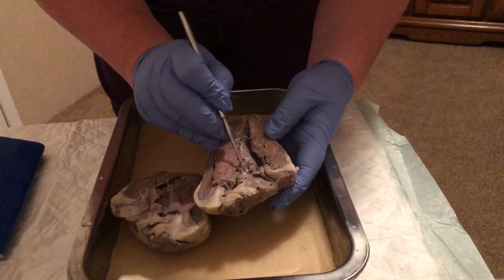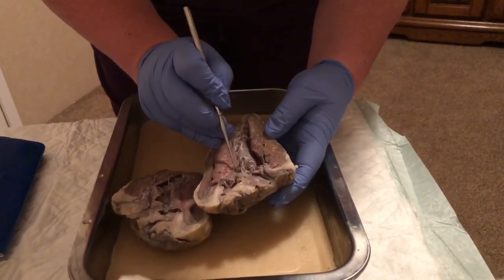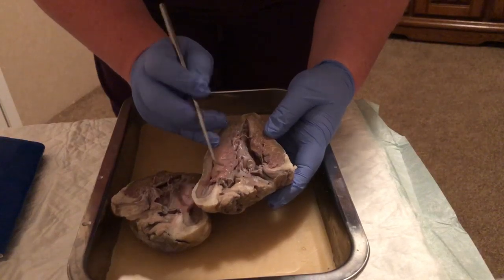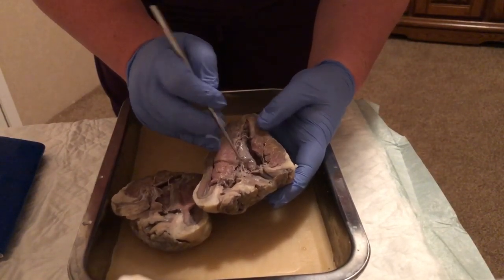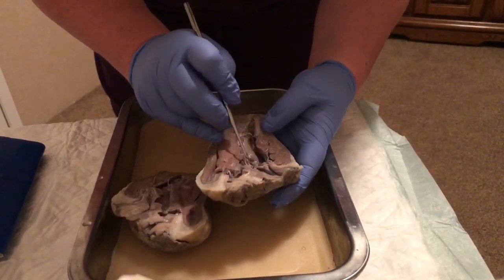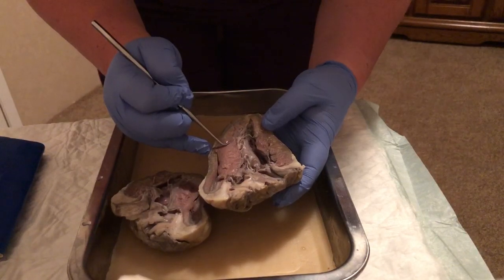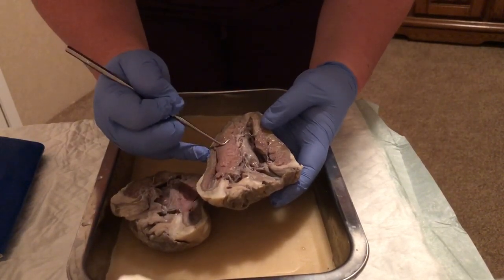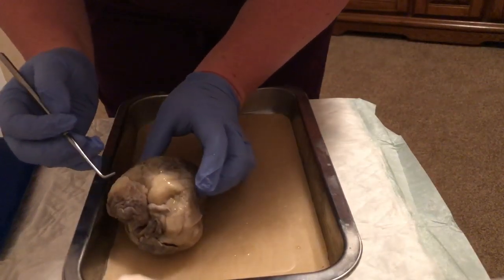The strings that are attached to the valve are the chordae tendineae, or heartstrings, here. And these strings attach to the papillary muscle, which is here, this muscle here. The part that separates the heart from left to right side is the interventricular septum. And that's our dissection of the sheep heart.